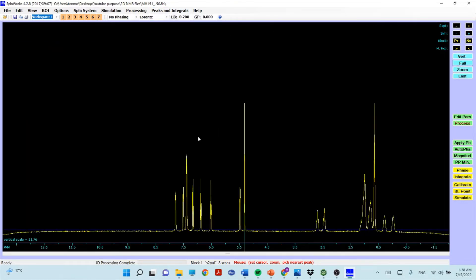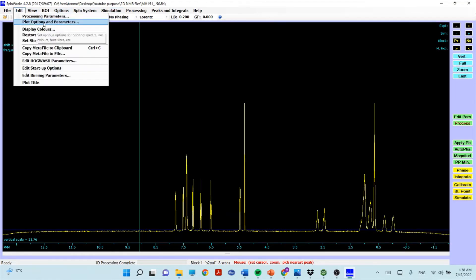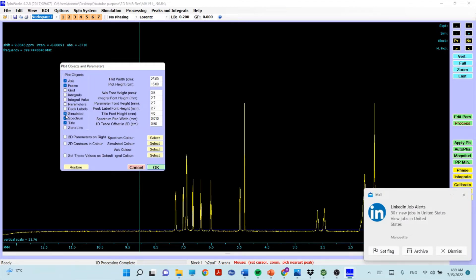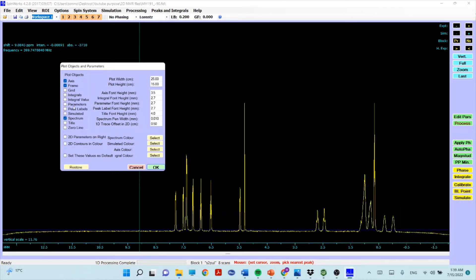Under Edit, go to Plot Options. You can keep the axis; some people like the frame — especially for 2D you should keep the frame, but for 1D you can remove it. For 2D you don't need integrals, integral values, parameters, peak levels, or simulated spectrum — just keep the title, axis, frame, and spectrum. You can also set the font size to around 5.